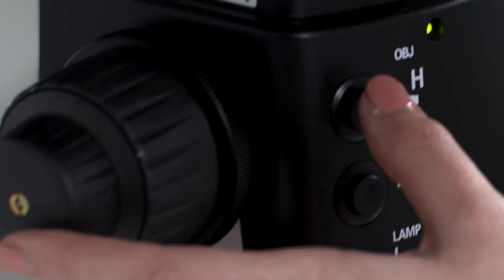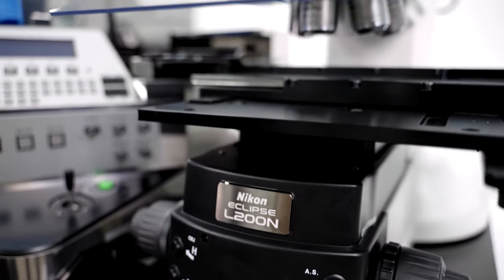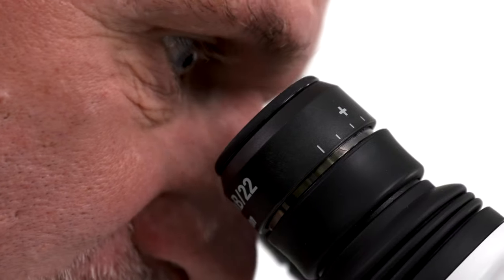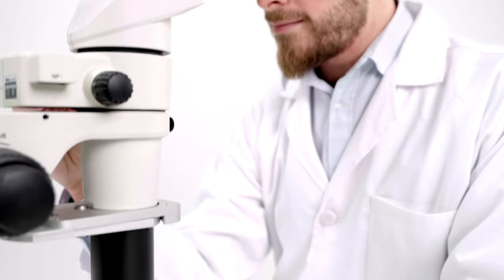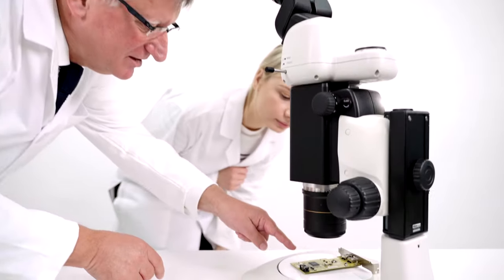Selected Eclipse stands and accessories feature intelligent functions to transfer configuration and status changes to a PC with control software such as Nikon's NIS Elements Imaging Suite. Some of these variables include objective lenses present, the one in use, illumination intensity and aperture settings, and stage and focus coordinates. As the range is rich with accessory choices, a profound change in microscope build and configuration is both expected and certainly possible. We really understand that the microscope is a tool to help our clients now and, importantly, adapt as and when their inspection requirements change in future.